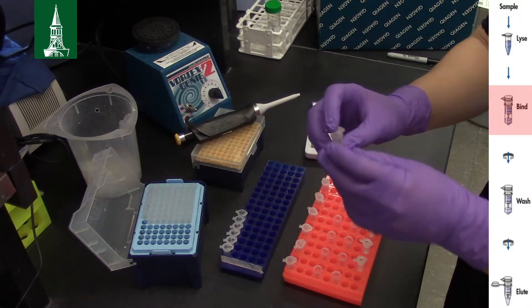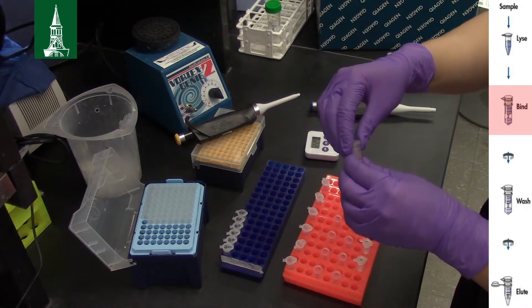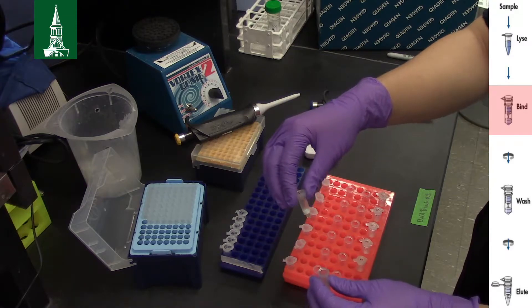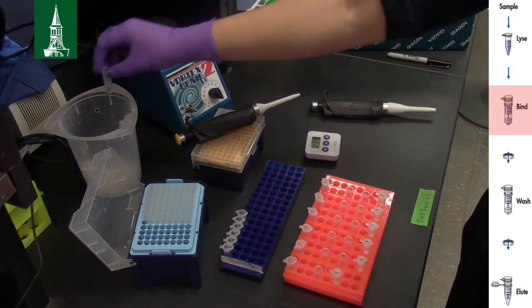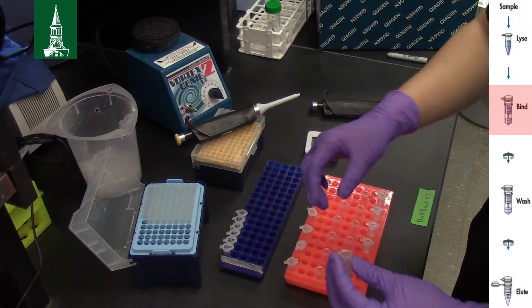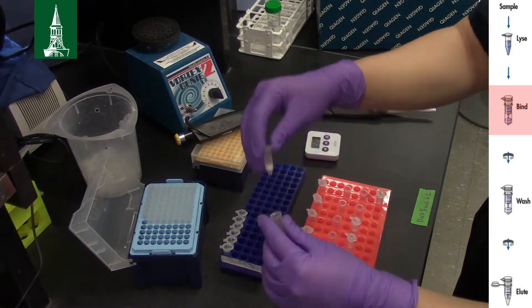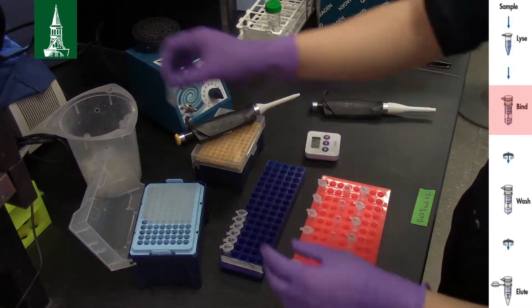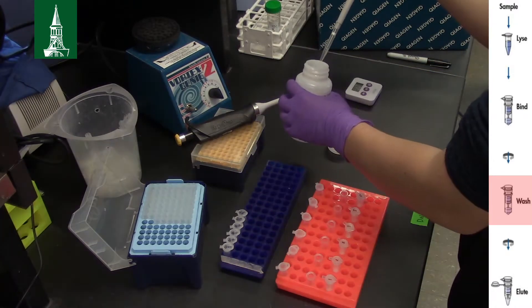Discard the collection tube with flow-through. Place the spin column in a new 2 ml collection tube. Add 500 µl of buffer AW1.